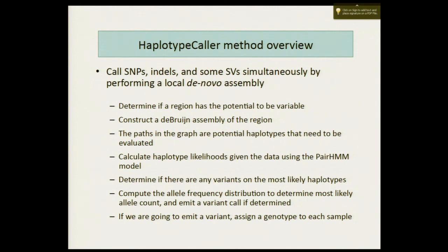So because of this, in the haplotype caller, you're not actually using the alignment of any read. You're simply using all the reads that are localized to a region and trusting its approximate mapping, which is pretty good. Aligners do a pretty good job of approximately mapping a read, but they don't do a good job of precisely aligning a read. So that's the fundamental difference. So you don't need to do indel realignment because you're not using the alignment of any read. Make sense? Okay.